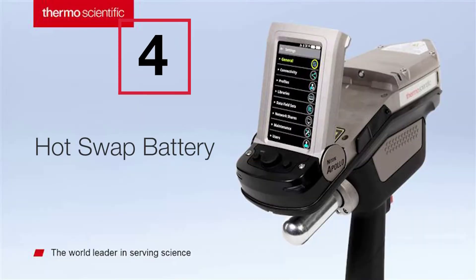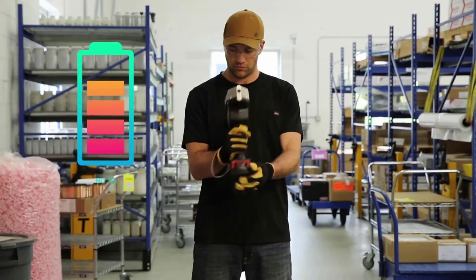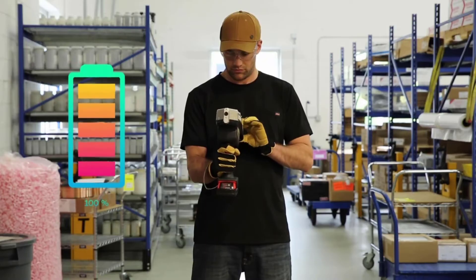Your time is valuable. Decrease your downtime with our hot swap battery feature, available at virtually any hardware store when a replacement is needed.